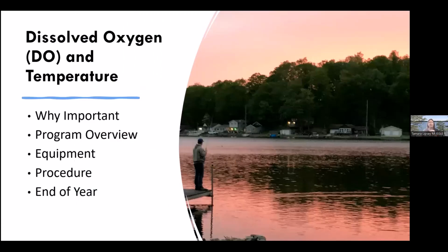So today we're going to talk about dissolved oxygen and temperature and why they're important first. Then we'll go over the MiCorps CLMP program overview for dissolved oxygen and temperature. We'll go over the equipment, we'll go over the procedure, and then we'll go over a couple of end of year reminders.